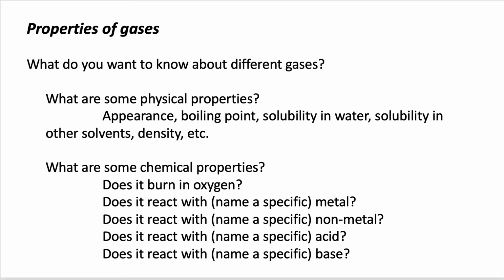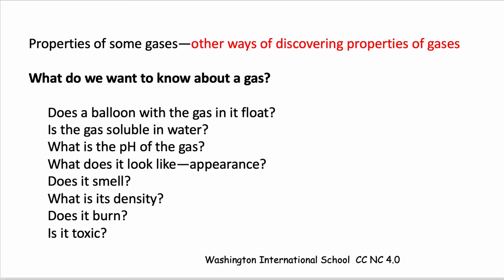So what properties might we want to know about? Some physical properties. Just read the list there of the physical properties. And then some chemical properties. What type of things are we going to react the gases with? And here are some other questions you could ask.